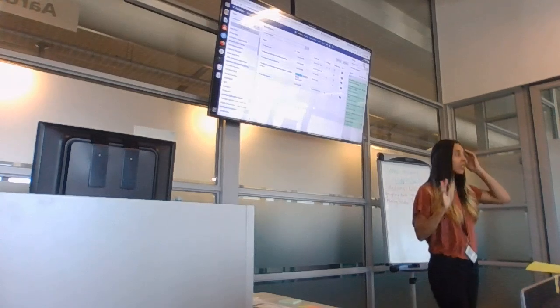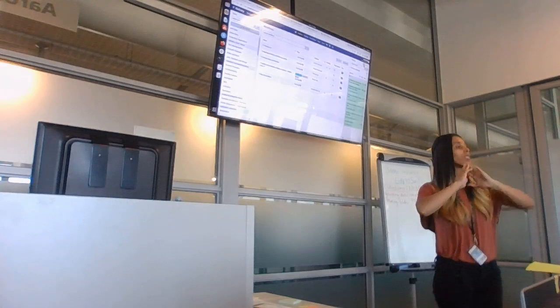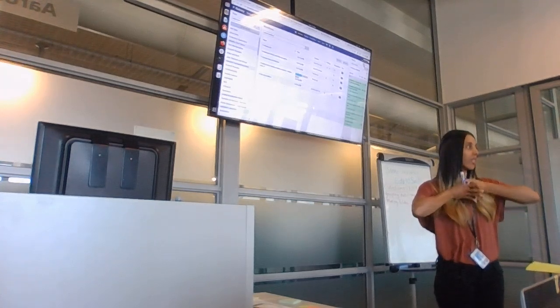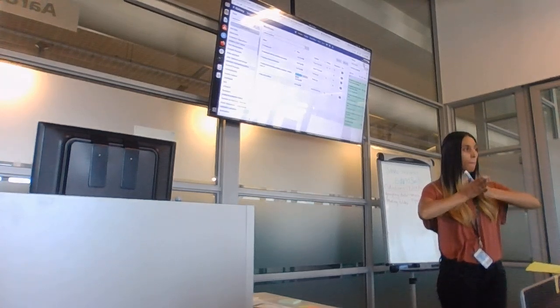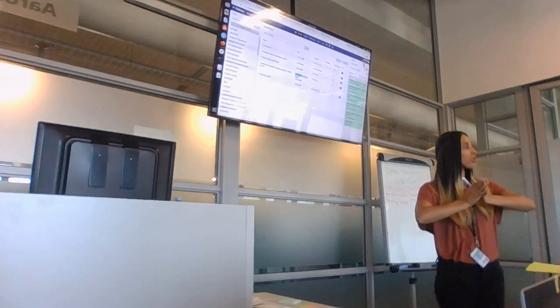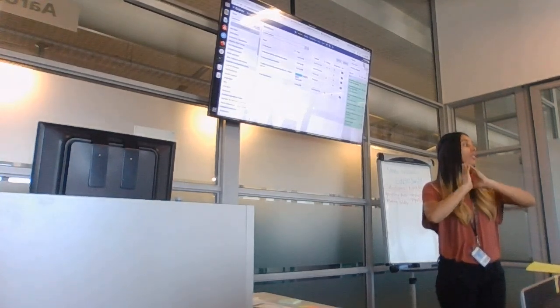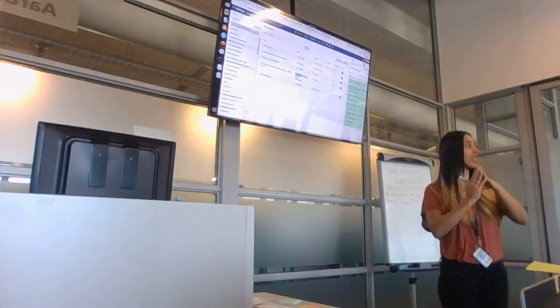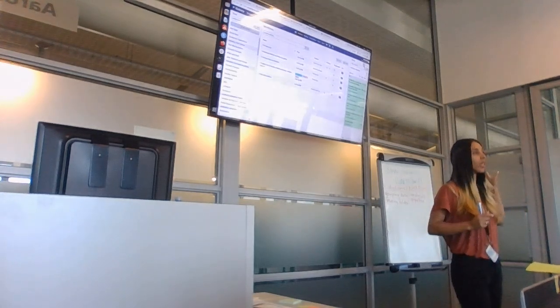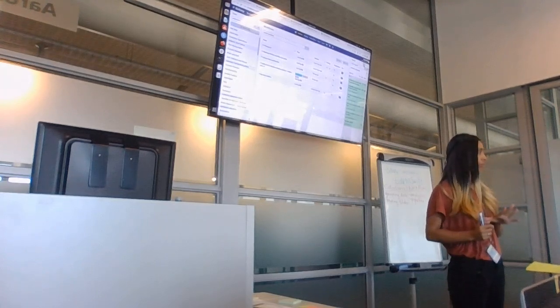After you've created your collection, we went straight into the workflow space, and that was running pipelines. We started adding two tools, first FastP, and then we said, take the input, the data collection that we've just made in our new history, and run FastP on all of that data.